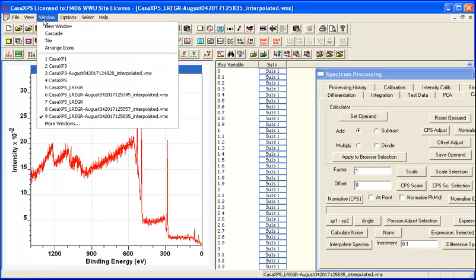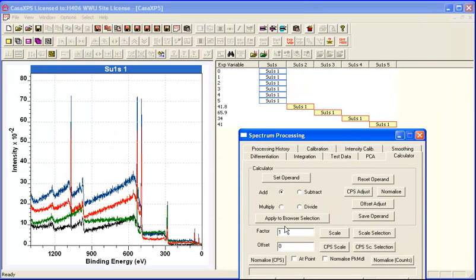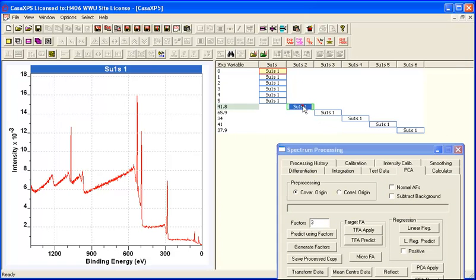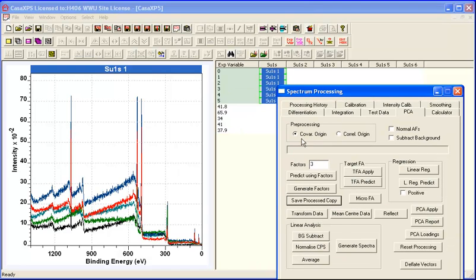So what I'll do now is go back, and again I'm going to copy that into the data file containing the original data and my basis vectors. So I have basis vectors here, and these are my target vectors.